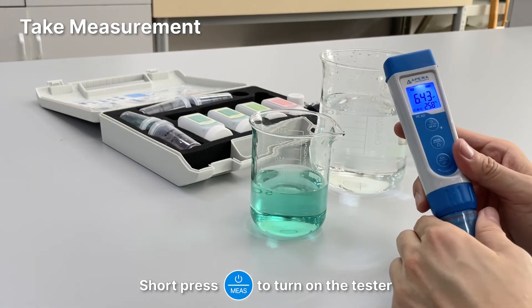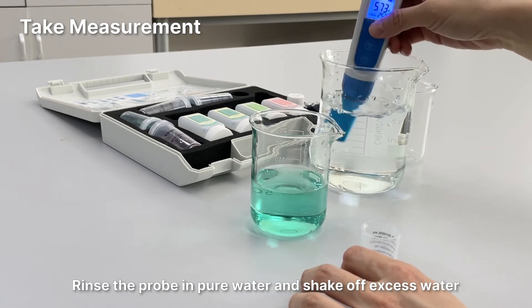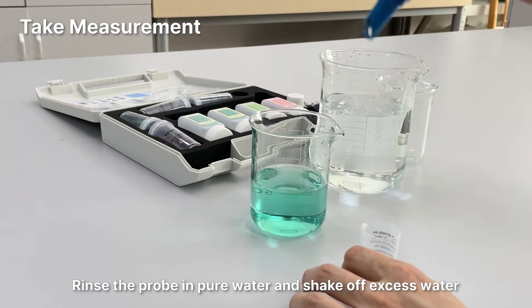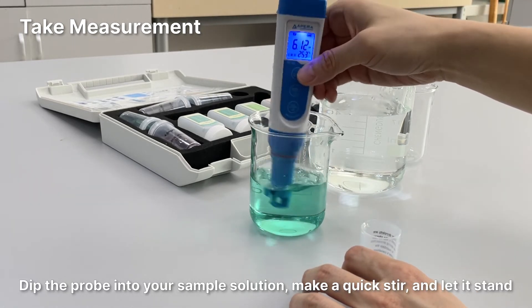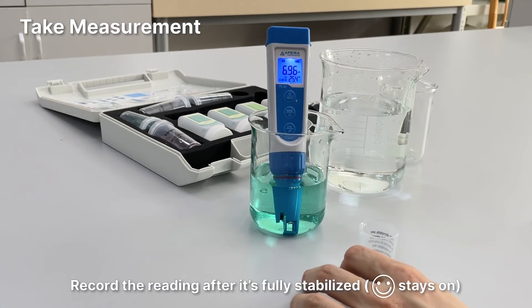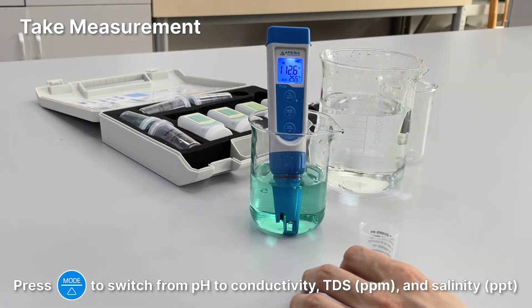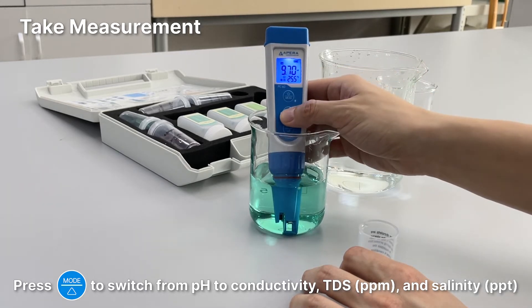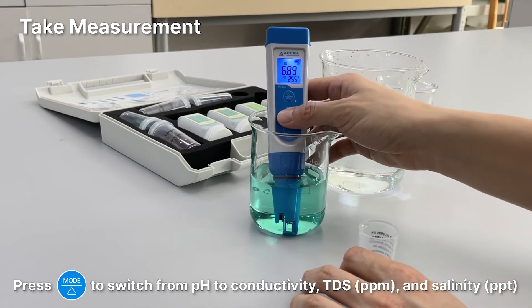Take measurement: Short press the power button to turn on the tester. Rinse the probe in pure water and shake off excess water. Dip the probe into your sample solution, make a quick stir, and let it stand. Record the reading after it's fully stabilized. Press mode to switch from pH to conductivity, TDS, and salinity.